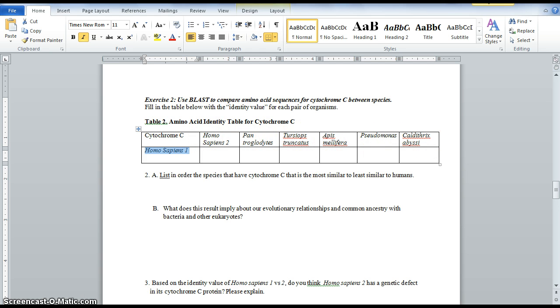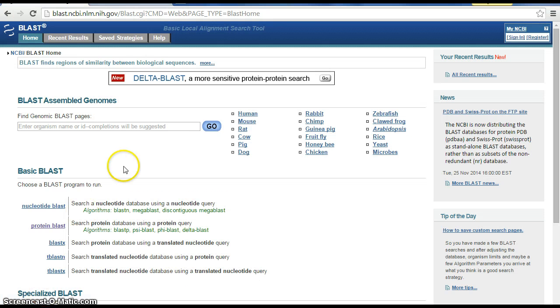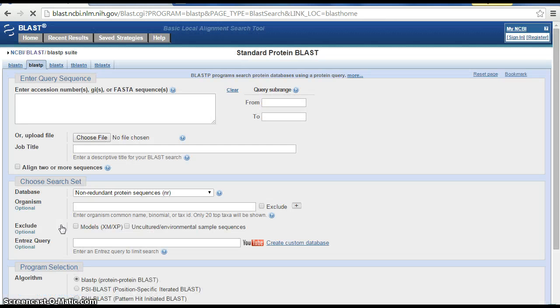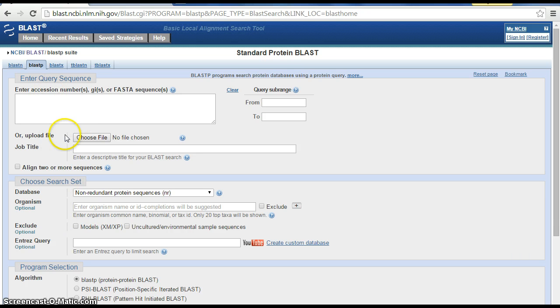To do this, let's go back to our BLAST website. Remember, we're doing a protein BLAST, and what we want to do is click on this box that says align two or more sequences.